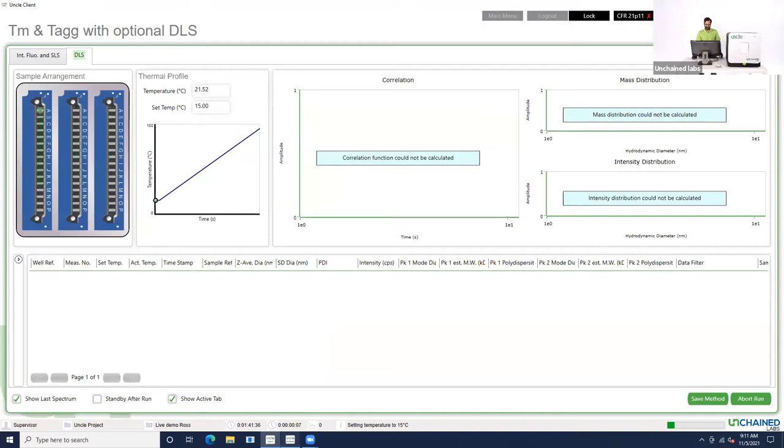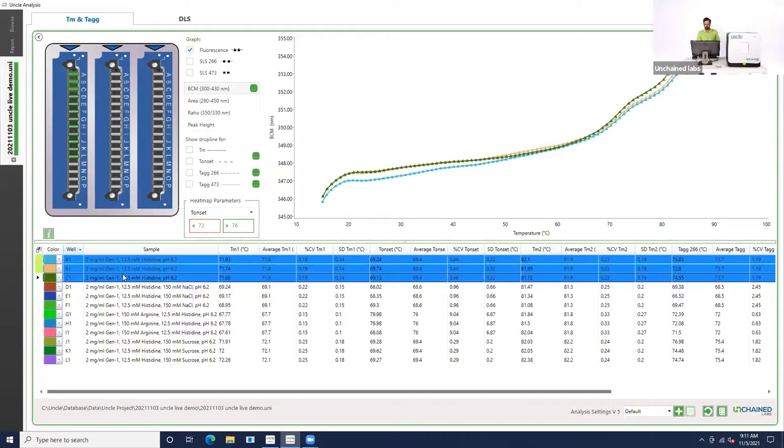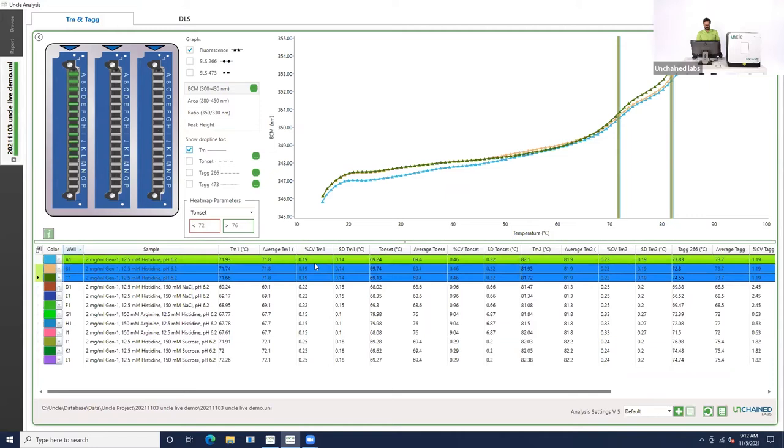Rather than stare at this for the next hour, I'm going to open up UNCLE analysis and show you some data from these samples that I prepared a little bit earlier. Let's take a look at the melting curve for our histidine alone sample — you can see all three replicates listed. We can highlight all those to take a look at them together and add a TM drop line. You can see that the TM drop lines overlap really well for those replicates. The average TM1 is about 72 degrees with excellent percent CVs. TM2 is shown at about 82 degrees, with less than 1% CV. So this is really reproducible, very clean data.